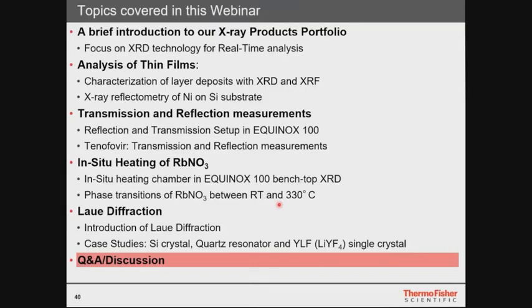So the signal to noise ratio is, in this case, 10. This is known as the counting statistics of your scan. Usually you have to choose a measurement time which yields the best signal to noise ratio which you need to solve your problem. And by increasing the measurement time, you can also get a better signal to noise ratio.